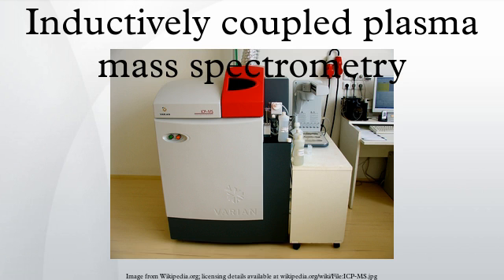A typical ICP-MS will be able to detect in the region of nanograms per liter to 10 or 100 milligrams per liter, or around 8 orders of magnitude of concentration units. ICP-MS is a method of choice for the determination of cadmium in biological samples. Unlike atomic absorption spectroscopy, which can only measure a single element at a time, ICP-MS has the capability to scan for all elements simultaneously. This allows rapid sample processing.